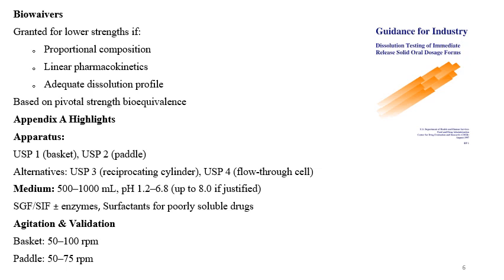I have also made a video on the biowaivers, the additional strength biowaiver requirement. You can go through those videos. Then Appendix A is given, which highlights the apparatus, medium and agitation. Then validation. So what is the requirement of apparatus, medium, agitation and validation?